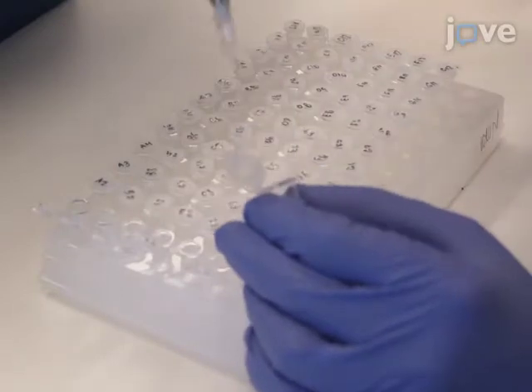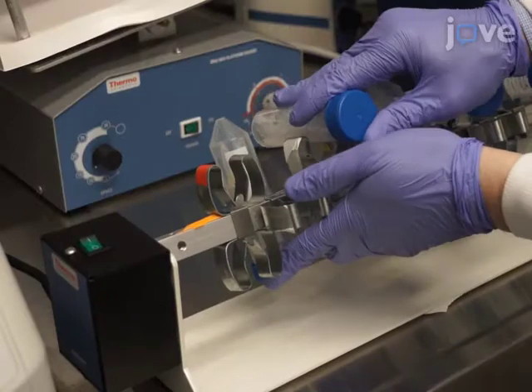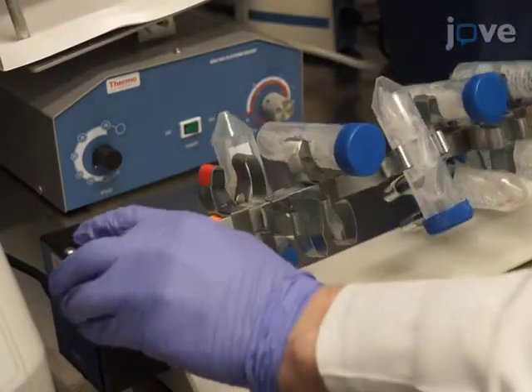Aliquot the sonicated material evenly to the protein G beads with specific antibody, and rotate the tubes using a tube revolver overnight at 4 degrees Celsius.